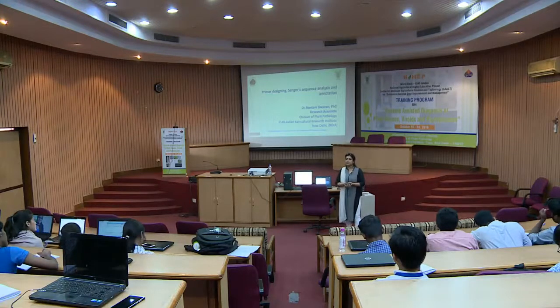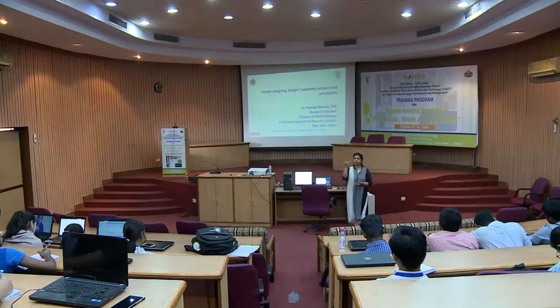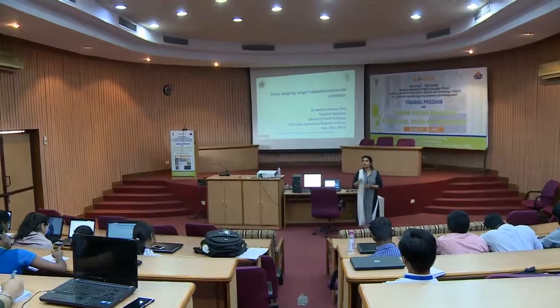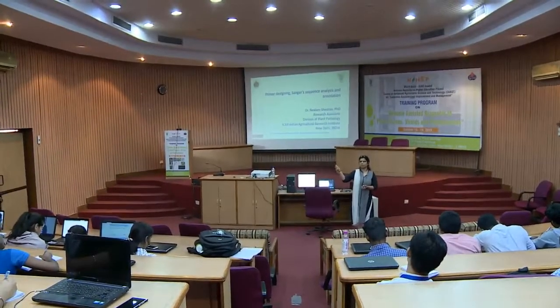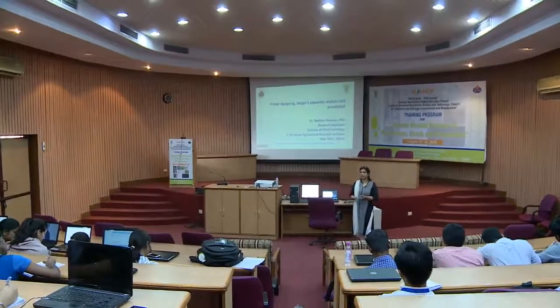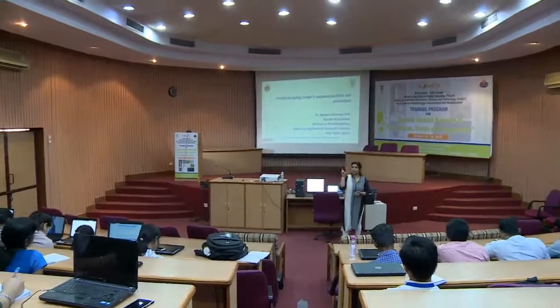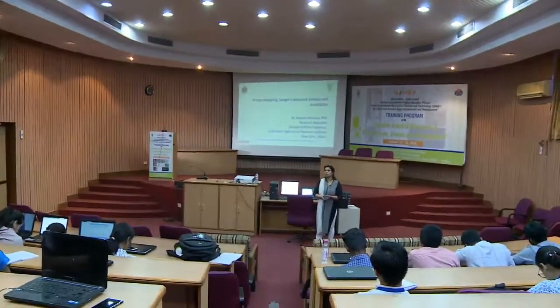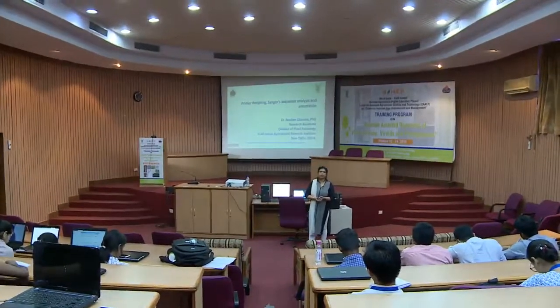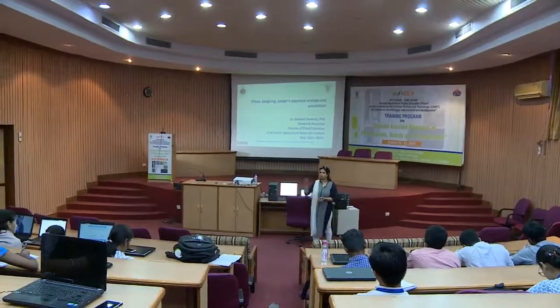Then the second criteria is the Tm of that particular primer. It should be somewhere between 50 to 62 or 65 degrees Celsius, right. Then the third criteria is the GC content of the region which you are picking to design the primer, that should be somewhere between 40% to 60%, right. So, these are the 3 points.